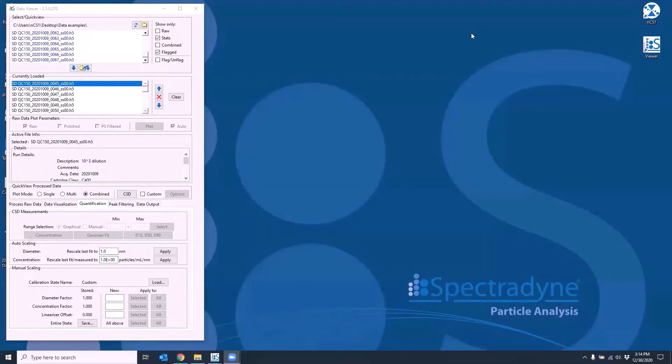Hi, I'm Nagdo, application scientist at Spectradyne. In this video, we'll be going over how to combine, save and export the data.